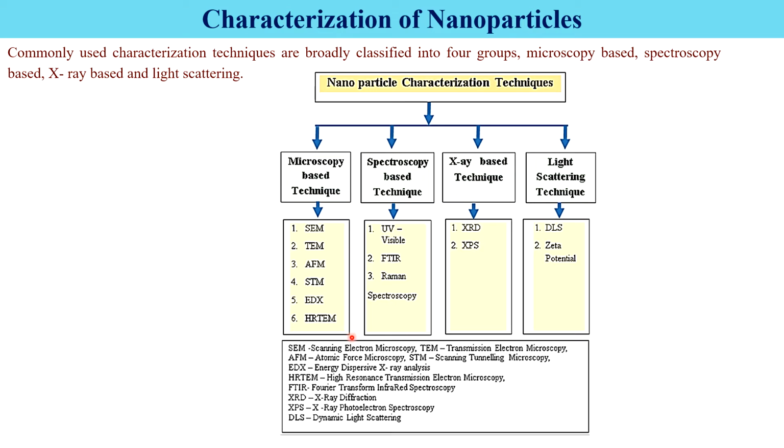All these are microscopy based technique. Spectroscopy based technique involves UV visible spectroscopy, FTIR, Fourier transform infrared spectroscopy, Raman spectroscopy, etc. X-ray based technique involves XRD, that is X-ray diffraction, XPS, that is X-ray photoelectron spectroscopy.